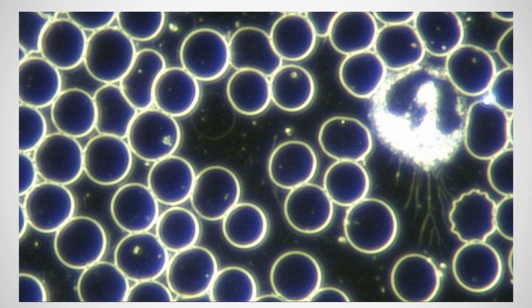And the benefit of dark field is really in allowing us to see things that are not visible in bright field. So for example, when we look at this white blood cell here, these fine faint lines coming off the white blood cell, this is actually a pleomorphic parasitic pattern, showing a parasitized white blood cell here. Quite an important thing to be able to see.